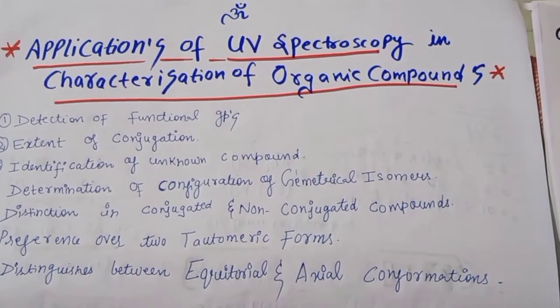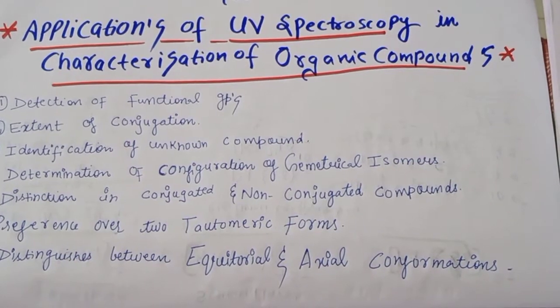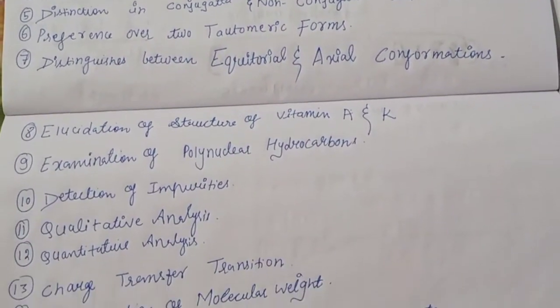Today's class topic is the application of UV spectroscopy in the characterization of organic compounds. In this video, we will talk about the applications of ultraviolet spectroscopy. Here there are 15 applications I have mentioned in this topic.